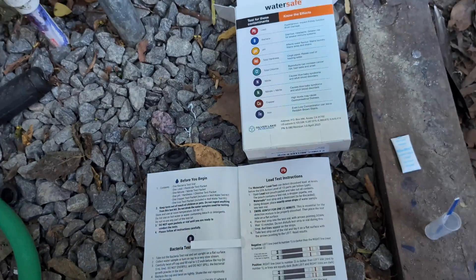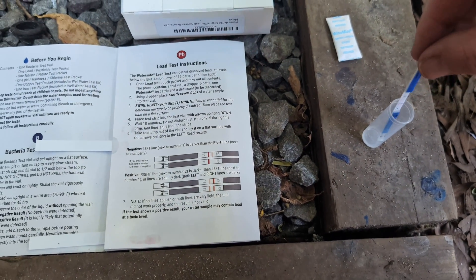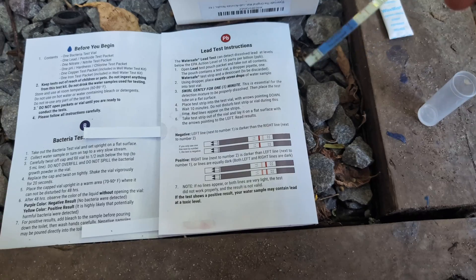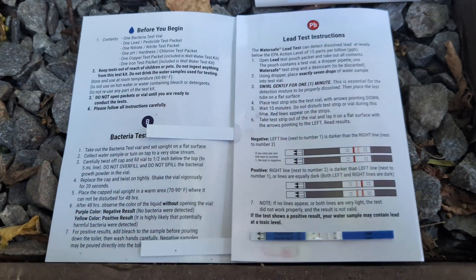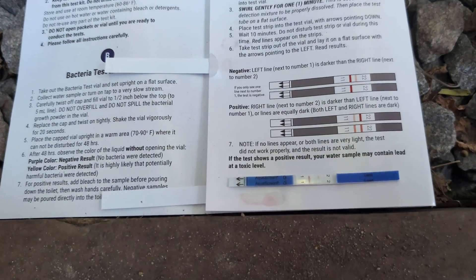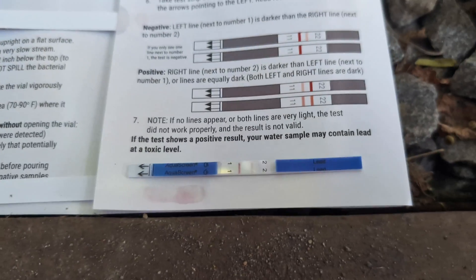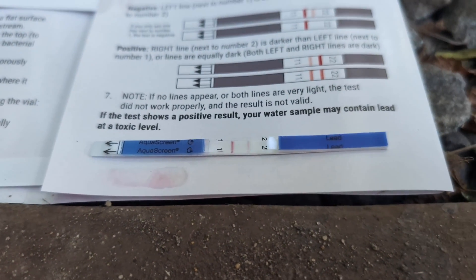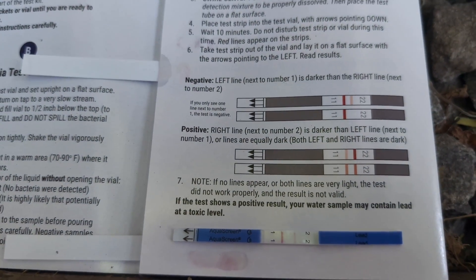We're now at 10 minutes on the lead test. I take this strip out and point the arrows to the left. I want the left line to be darker than the right line, and it definitely is. So that means we are negative for lead.